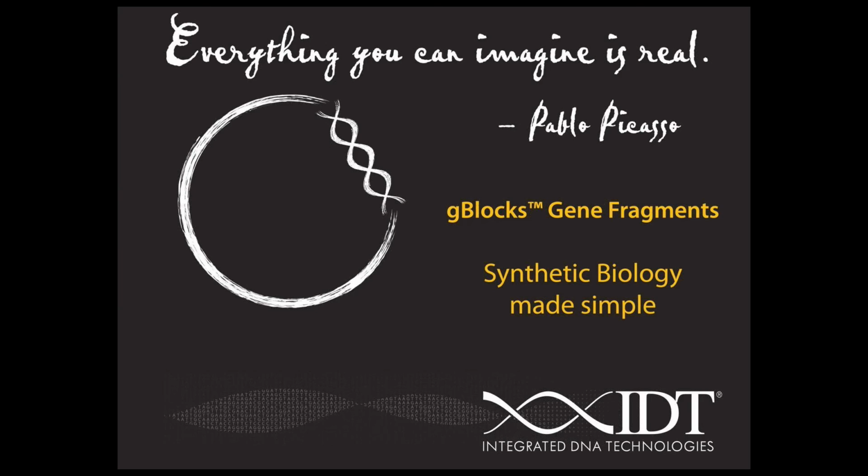Sure. Yeah, we can help in a variety of different methods with CRISPR. One of the challenges with CRISPR is the fact that this is such a new technology. It really just kind of gained prominence in 2013. So it's relatively new, and there's a variety of different methods that people are utilizing to get CRISPRs into cells. One of the things we need to know from the customer is what method they want to use. Do they want to use a certain plasmid that would express both the RNA and the Cas9 protein? Do they want to do those on separate plasmids?